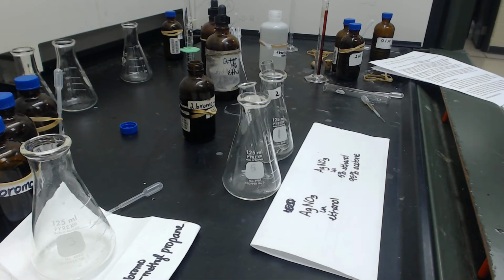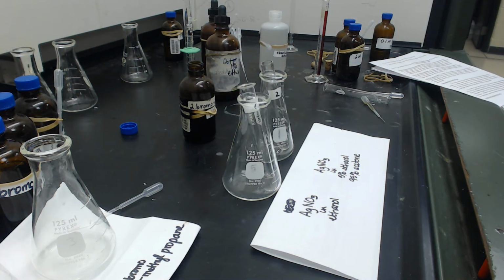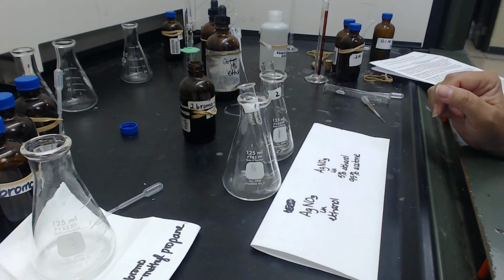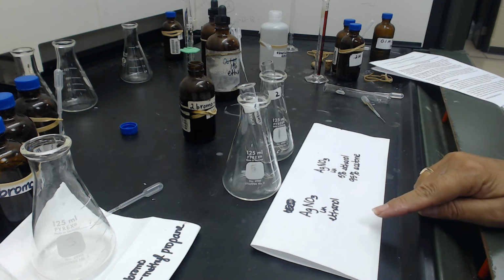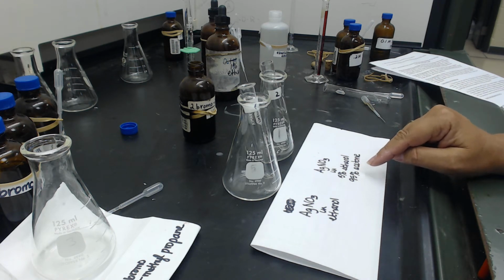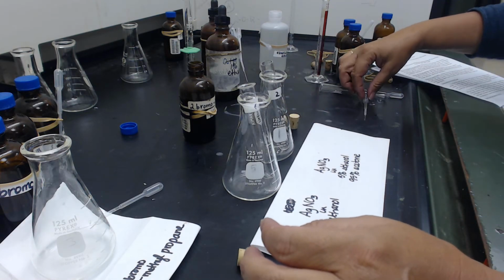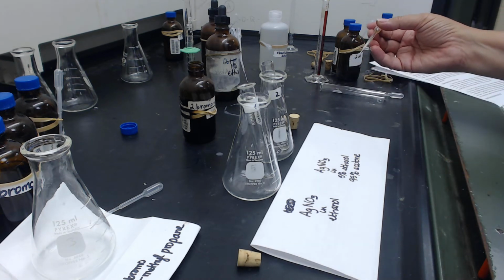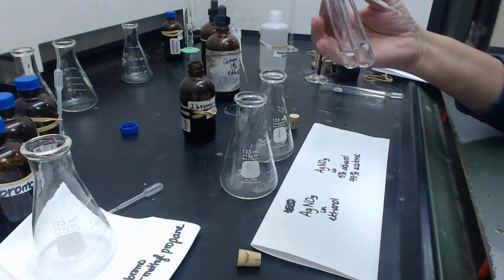Okay, so this time we're doing the effect of solvent polarity. On the left, I've got 2 milliliters of the same silver nitrate in ethanol that we've been using all along. And on the right, I've got silver nitrate in mostly acetone, 95% acetone. So we know ethanol is polar protic, acetone is polar aprotic. And so I'm going to add a drop of 2-bromo-2-methylpropane into each. I've got them labeled 1 and 2 so we can tell the difference.